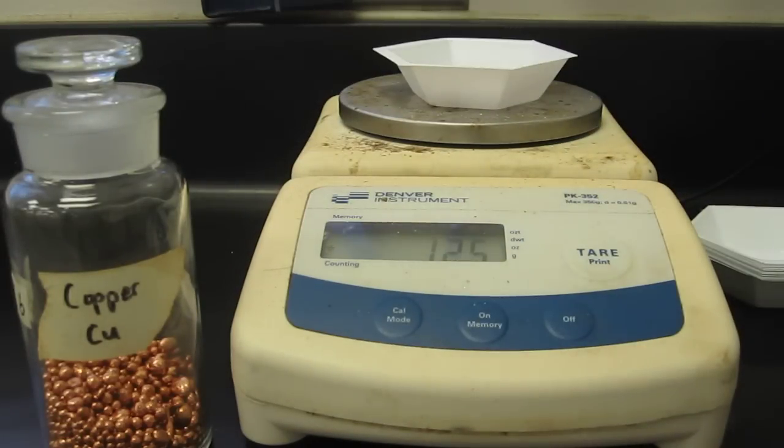And then when we put it on there, we have an inexact measurement of 1.25 grams. And anytime you're using a measuring device, you're always going to have an inexact measurement.